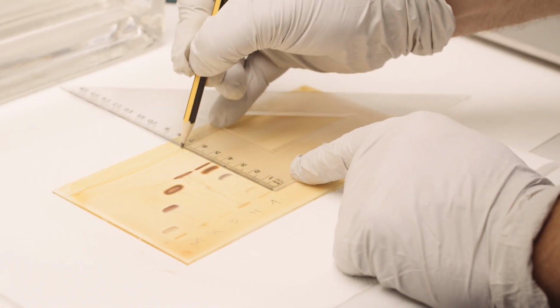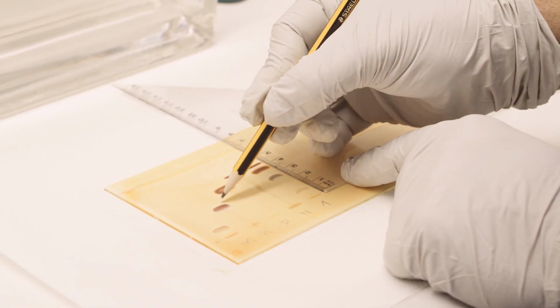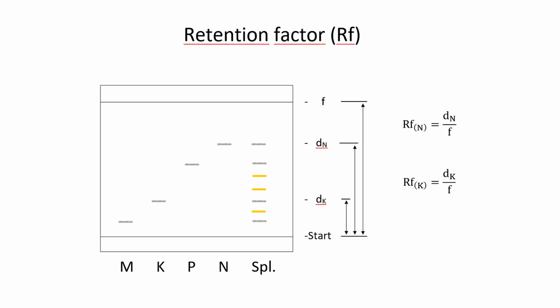The colored spots in the extract samples are expected to match the spots of the alkaloid standards. We can conclude from this that all 4 alkaloids are present in our sample. Some additional spots are observed in the sample and are the result of other alkaloids such as thebaine.